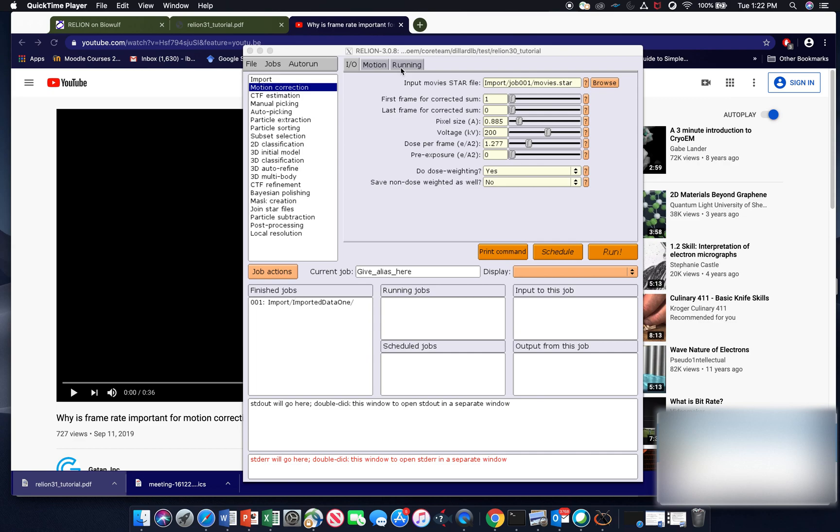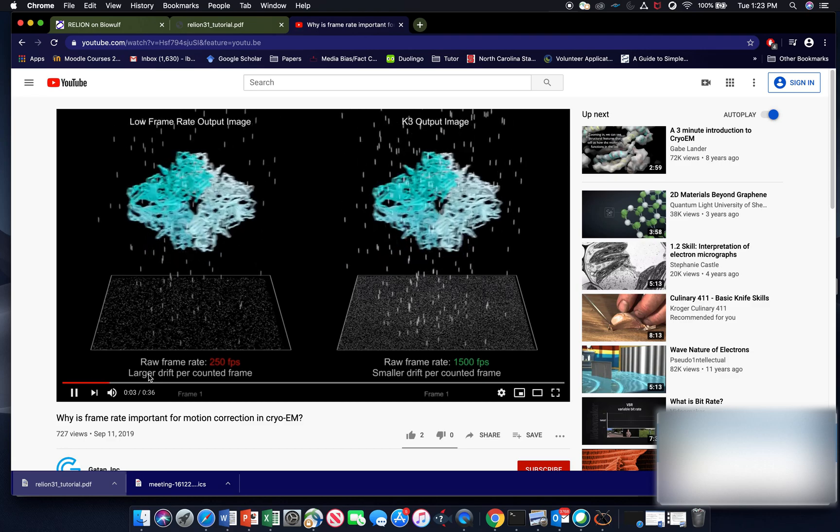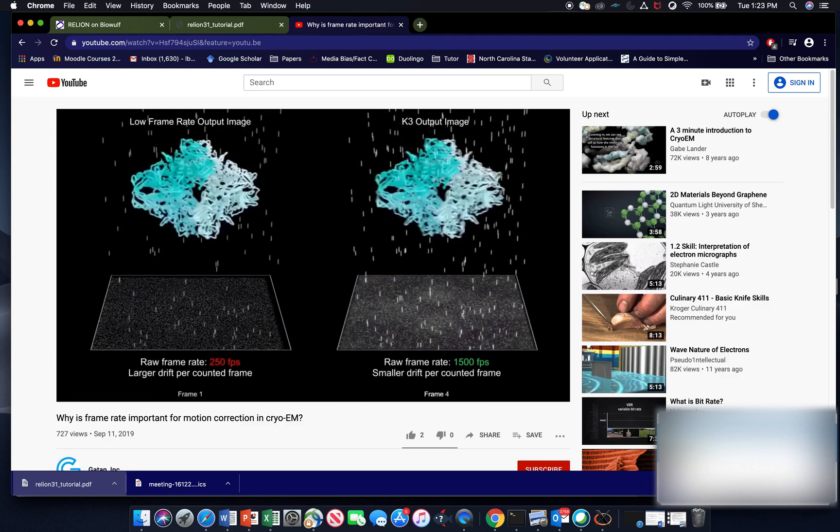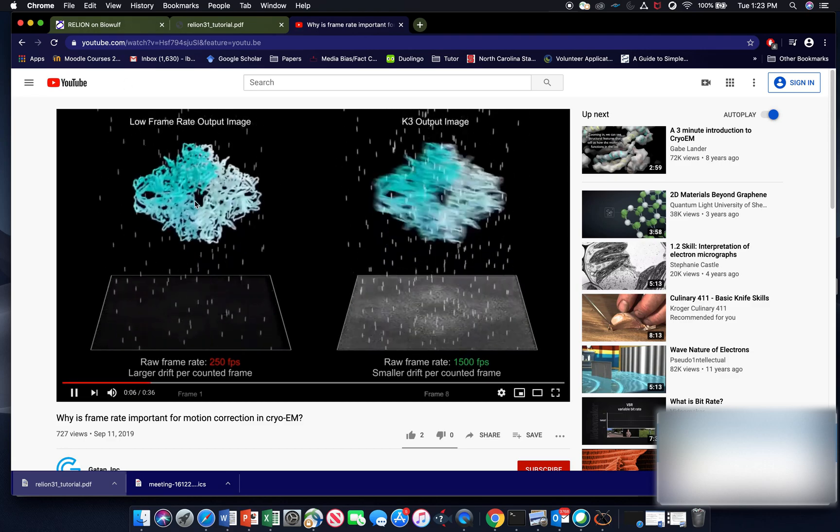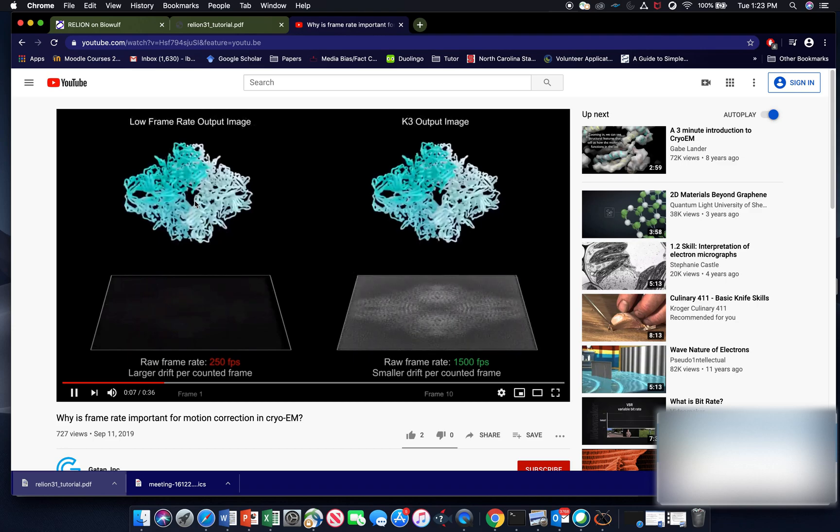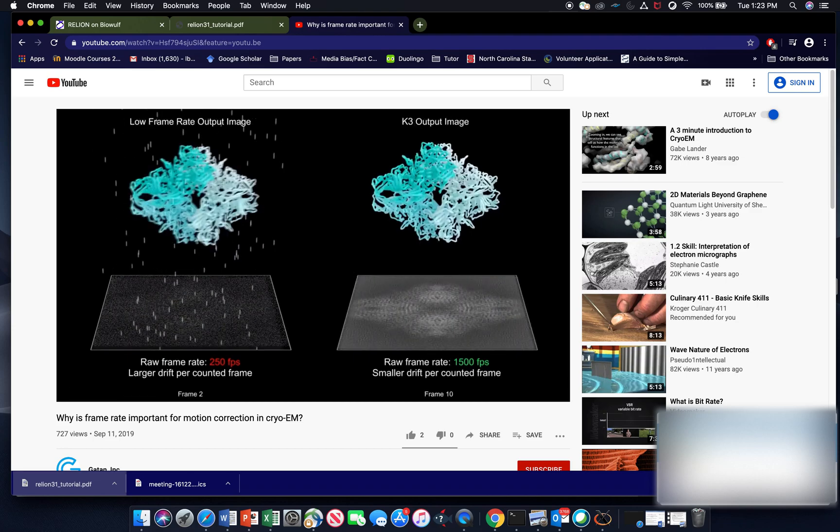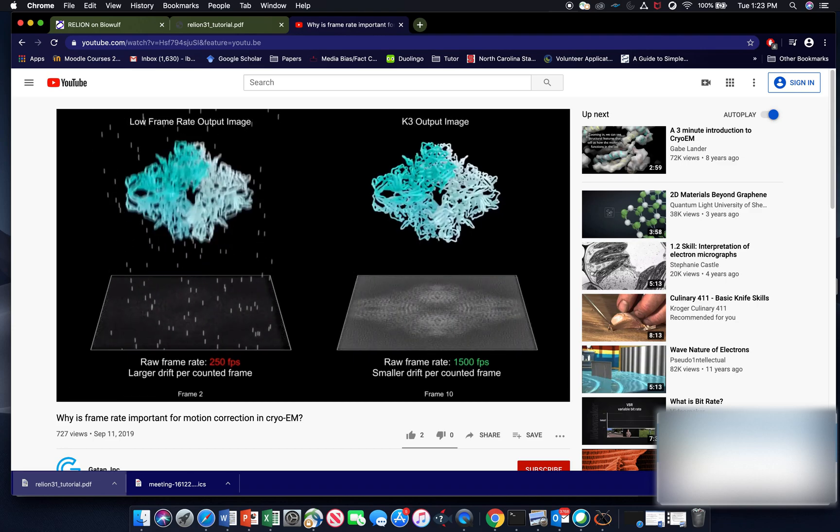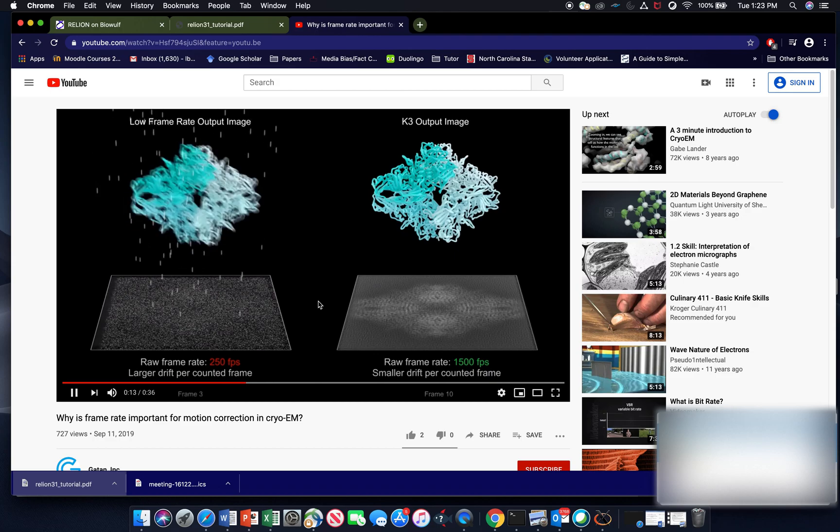For those of you who are just getting started, motion correction is kind of, I can explain it through this video here. So as we shoot our particles with electrons, they move and the ice in the micrographs actually swells. And what that can do is limit resolution, which I'll show here in a second.